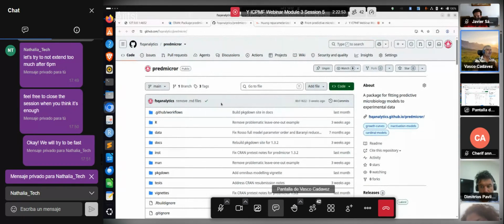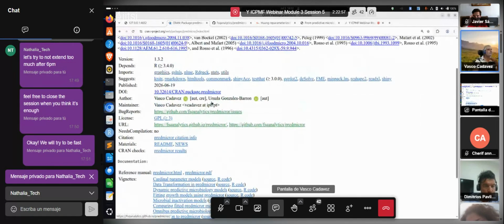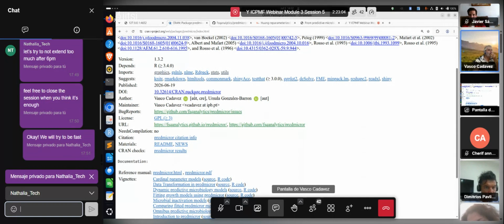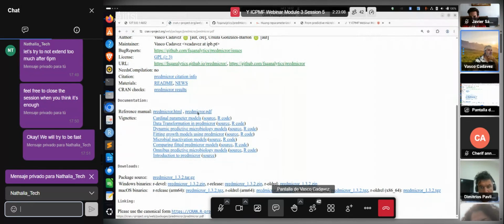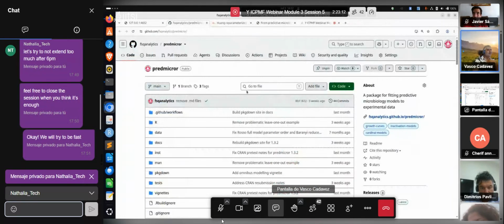But you also have, in CRAN, sorry, a manual. Where is the manual? Here you have a manual, so you can download it to have the functions.